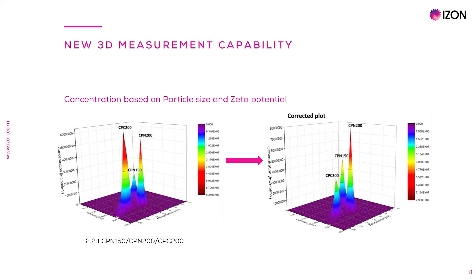For example, here is a 3D plot of a trimodal 2-to-2-to-1 CPN-150, CPN-200 and CPC-200 mix, where before data analysis correction, the charged carboxylated polystyrene CPC-200 particles are vastly overrepresented.